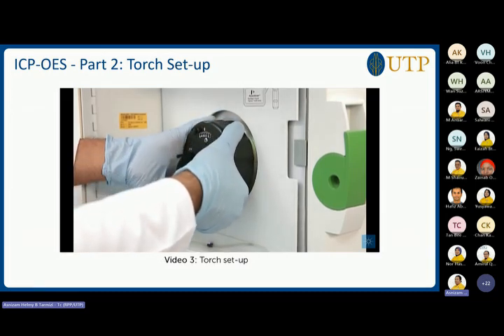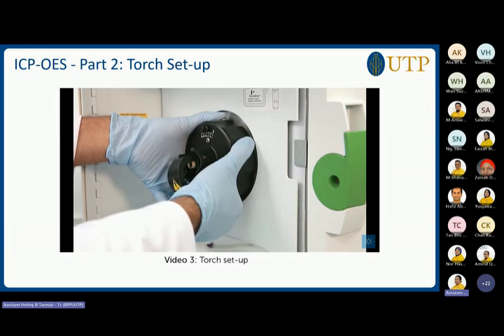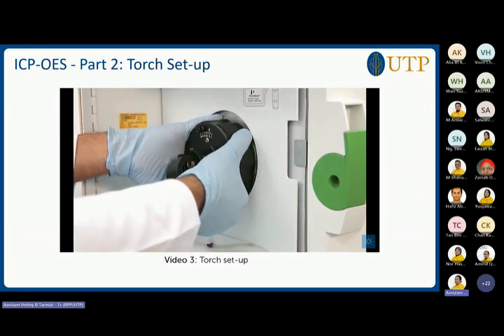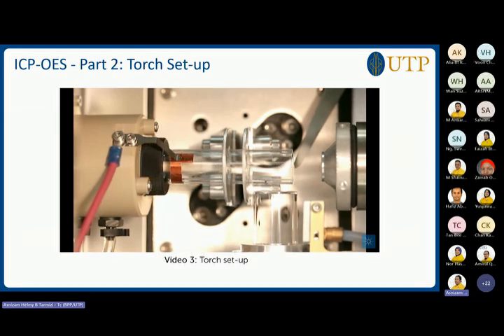To ensure proper ignition, turn the torch module an additional 2 mm past where you want it to go, and then rotate back to the desired position. Verify that the ground pointer is in close proximity to the end of the torch. If required, adjust the ground pointer.